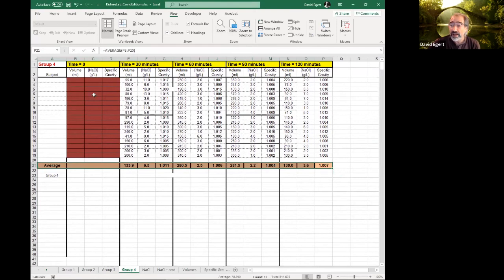This is before they have done any of the stuff that they've taken into their body. This is before their body has had to respond. This is when you're doing the initial voiding of your bladder. We use this time to have people practice taking the measurements, using that method for measuring sodium chloride and things. So we don't care about time equals 0.